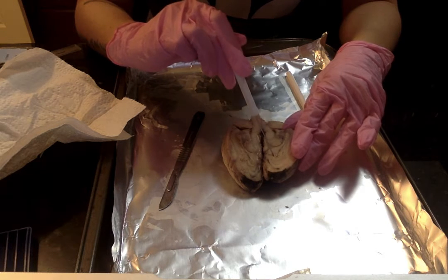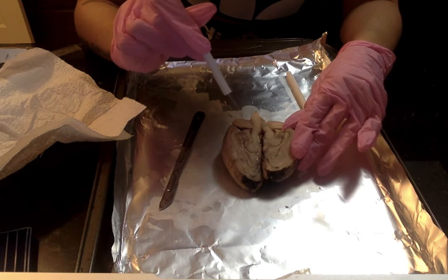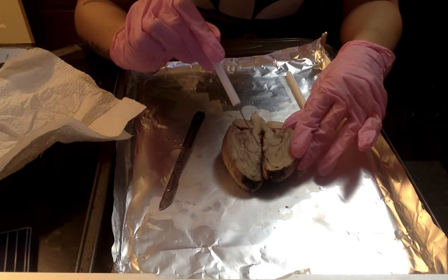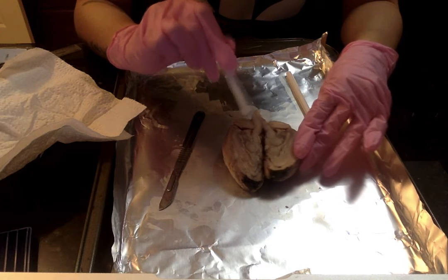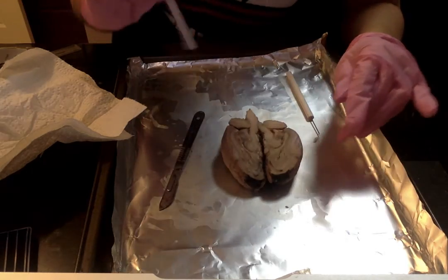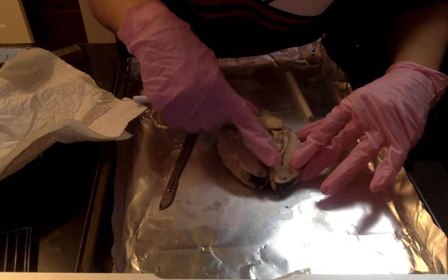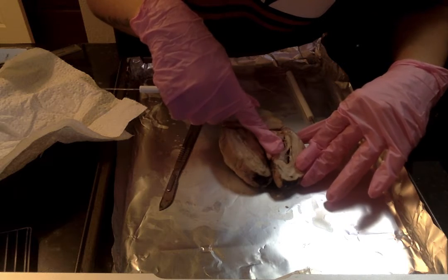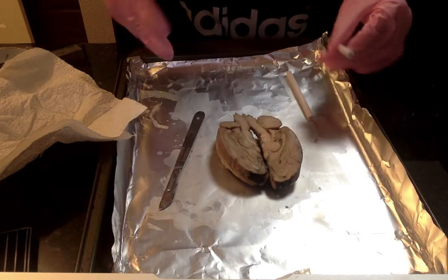Right below that, we notice the fornix, whose primary role is to transmit information from the hippocampus to the mammillary bodies and to the anterior nuclei of the thalamus. So yes, we have the fornix. It's all right in this little pocket right here. It's going to be the corpus callosum, the ventricles, and the fornix. Kind of have to separate it a little bit to see it better.